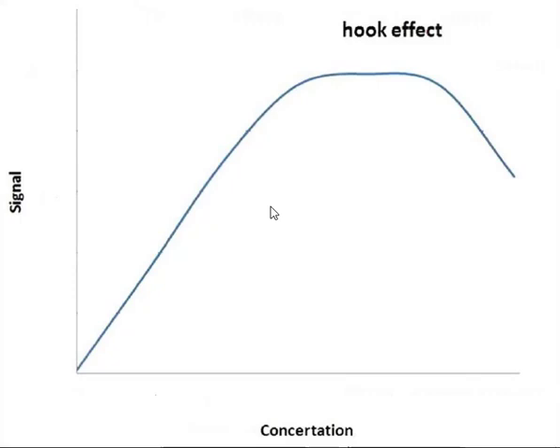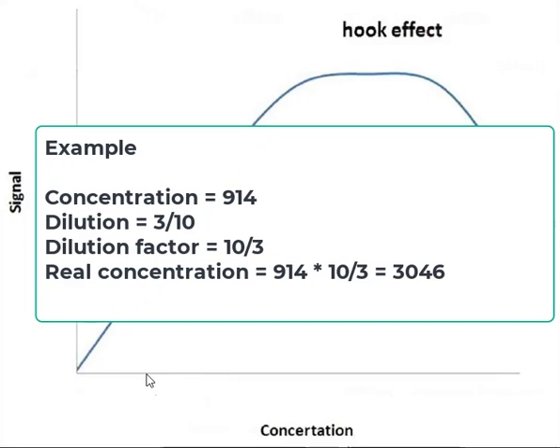At a dilution after which you see an overmax, the ELISA reader reads it as overmax. This dilution, for example, is 30% or 40% dilution. You have a concentration. It is real, and it's within the limits of your reportable range. You have to multiply that by the dilution factor, and then the result is your real concentration.